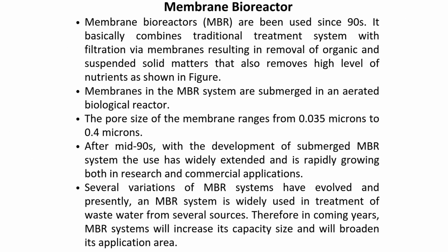Finally, let us examine membrane bioreactors or MBRs. These have been in use since the 1990s. They basically combine a traditional biological treatment system with membrane filtration. This results in the removal of organic matter, suspended solids, and high levels of nutrients. In an MBR system, the membranes are submerged directly in the aerated biological reactor. The pore size of these membranes is very small, ranging from 0.035 microns to 0.4 microns.